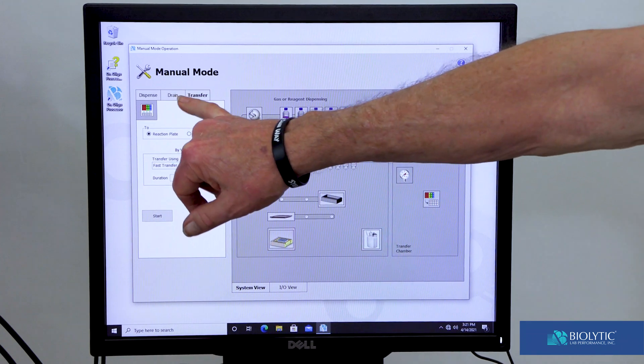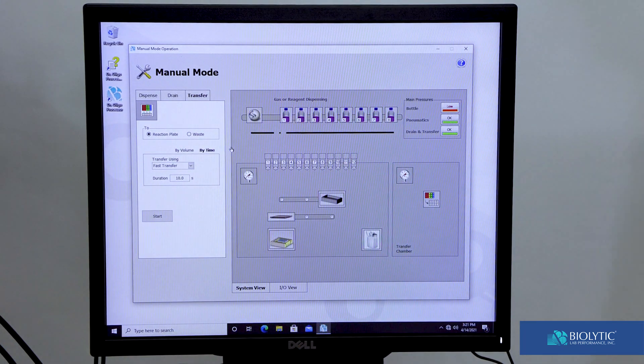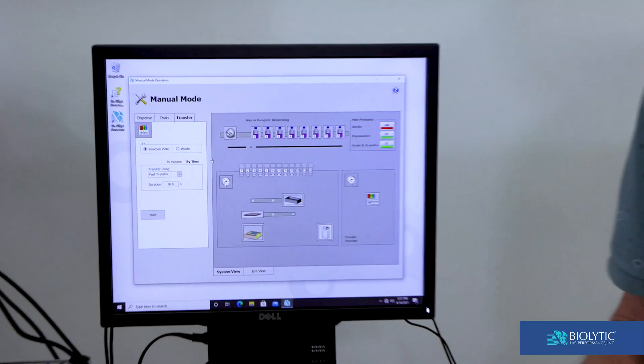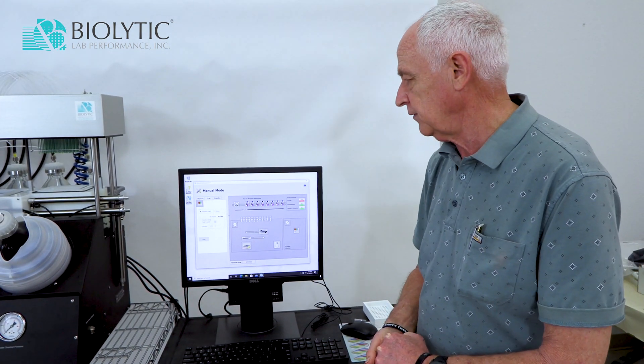The manual mode has three tabs to choose from: Dispense, Drain, and Transfer. Those are the three things that this instrument does — it dispenses something, it drains it, and you can transfer from a deep well plate into the reaction plate.